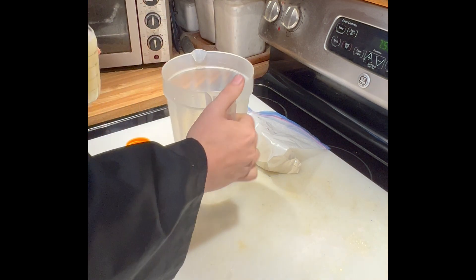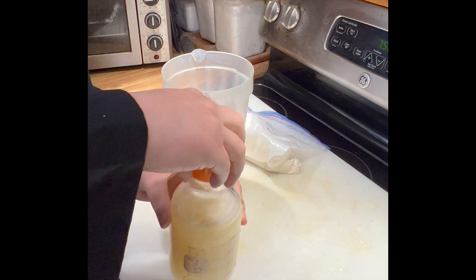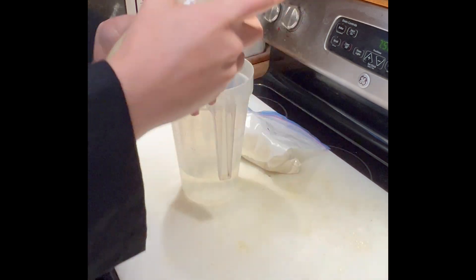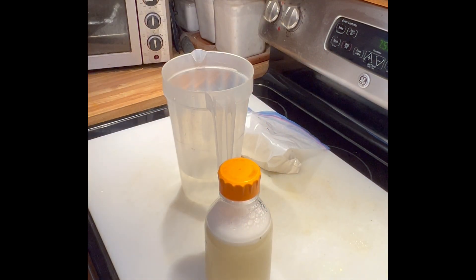If you end up with stuff stuck on the bottom because you had moisture stuck in the bottom of your bottle, turn that bottle upside down and the bubbles cavitating on the bottom will cause that stuff to break free and it will mix up for you.